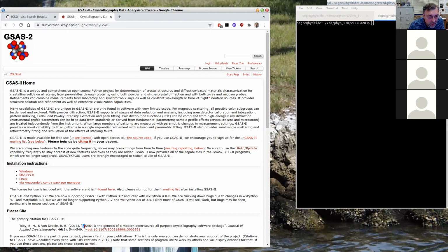The original program, GSAS-I or GSAS, was all written in Fortran and was closed source. This is basically open source because it's all Python. So you can take a look and make changes and make suggestions, and they have a Git page where you can submit changes if you like. But you can download it from this site. You notice it's not Git, I'm sorry, Subversion at Argonne National Laboratory. Brian is at Argonne National Laboratory. Bob was at Argonne National Laboratory before he retired.